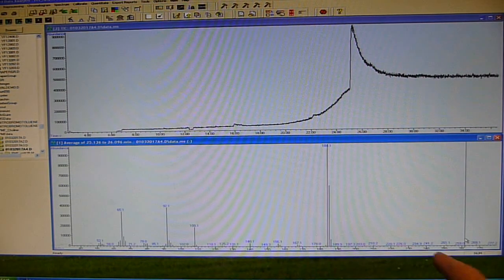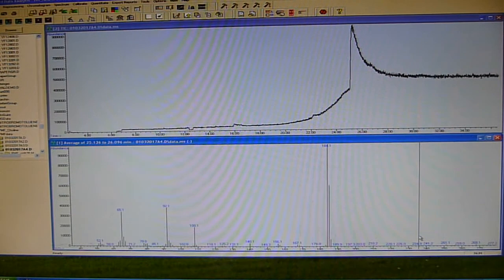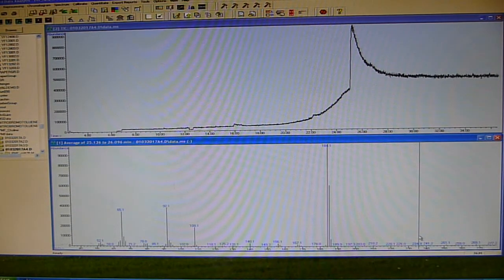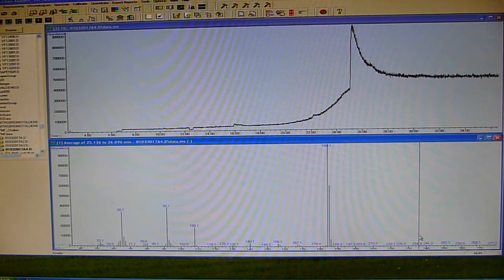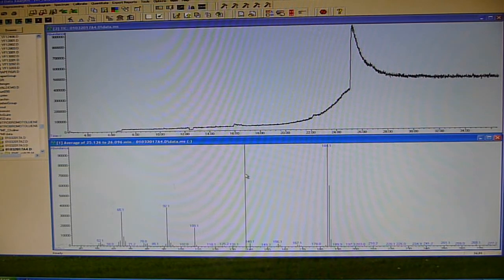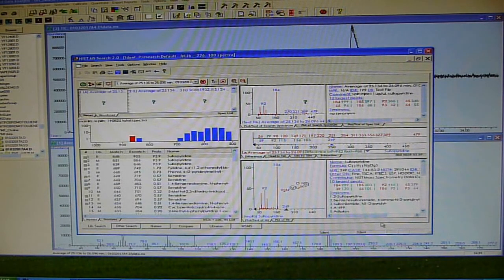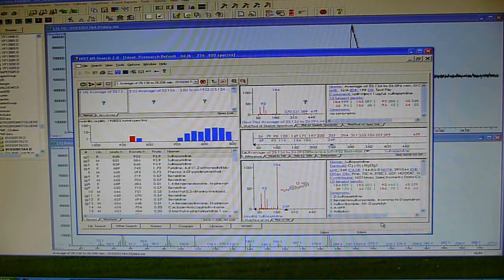You can see a big 184, but no 249 and no 250 - 249 being the molecular weight. So from 249 to the 184/185, that's a loss of 64 to 65. If you're losing 64 from a sulfonamide that has an SO2 in the middle of it, one should suspect we're kicking out sulfur dioxide. And if we do a library search, the top three picks are sulfapyridine, and you can see the reference matches the data.